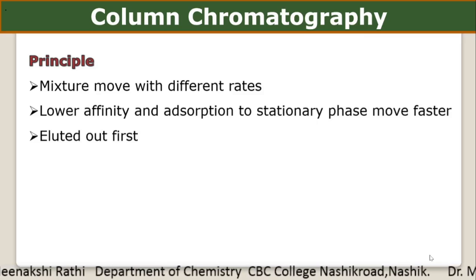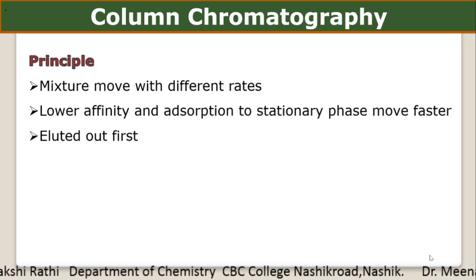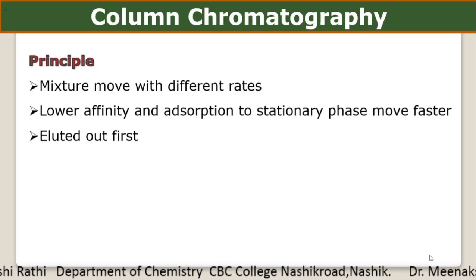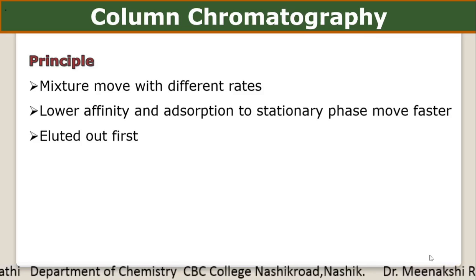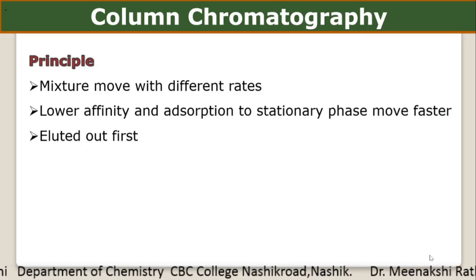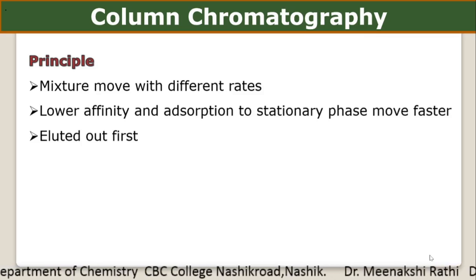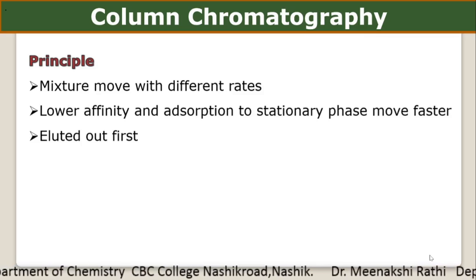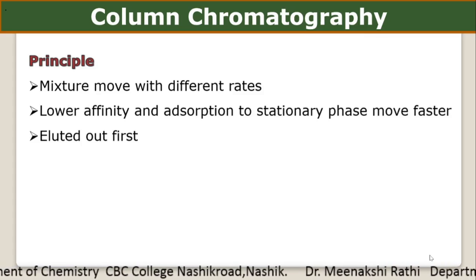and are eluted out first. Means those which have lower affinity and adsorption power to the stationary phase, which do not easily adsorb and have lower affinity, move fast and are eluted first, or come out of the column first.